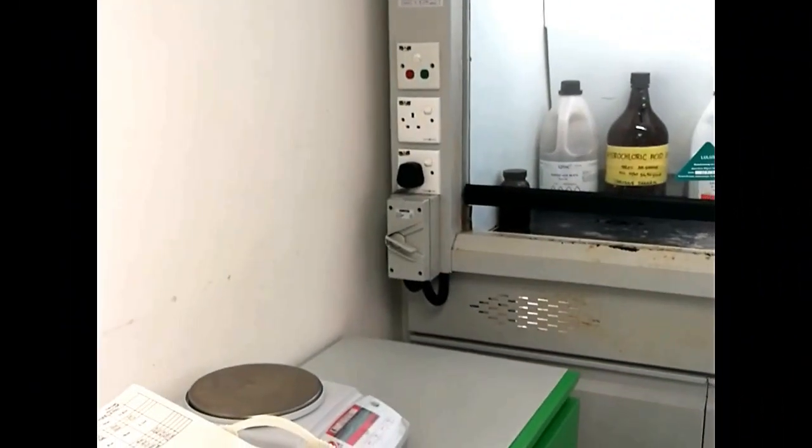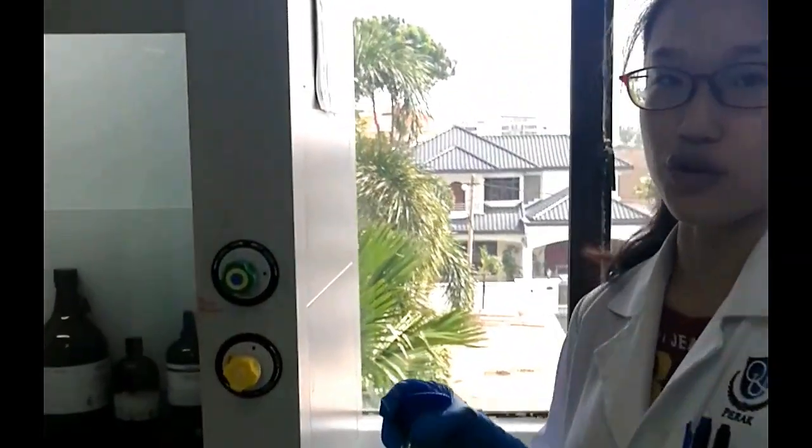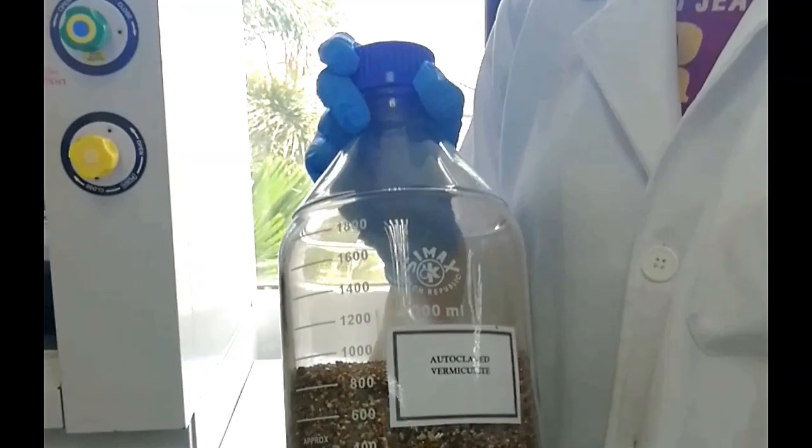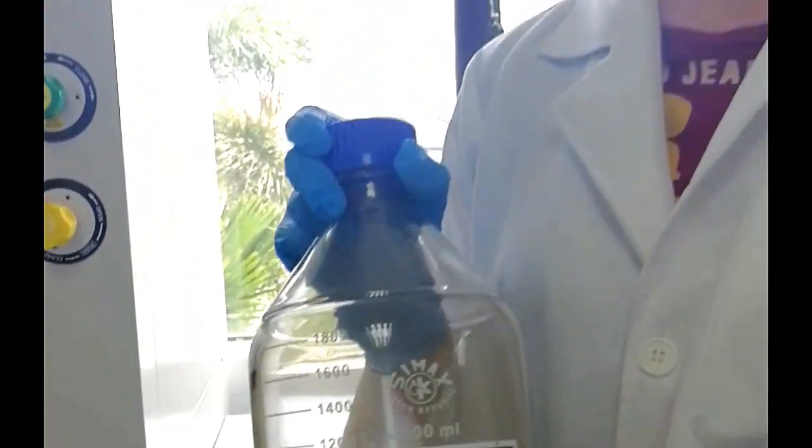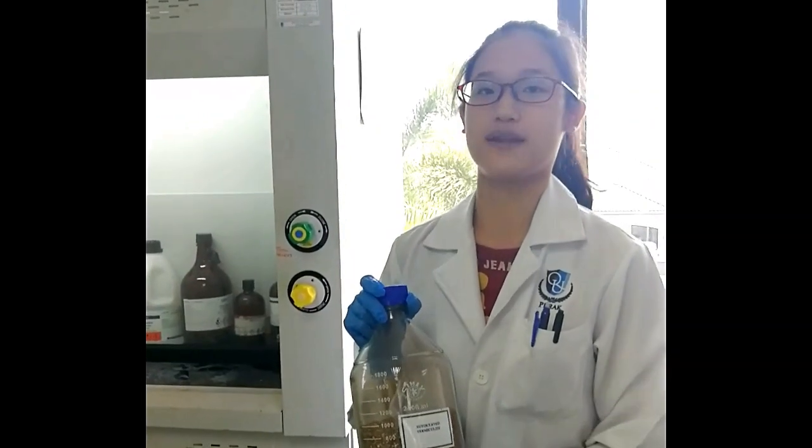I will be using PCR as well to identify the DNA. After I have identified the gene of the nitrogen fixation gene, I will use the autoclaved vermiculite to grow the plant, Clitoria ternatea, and inoculate the bacteria that I found in the field. I inoculate it and let them grow to check their specificity with the plant.